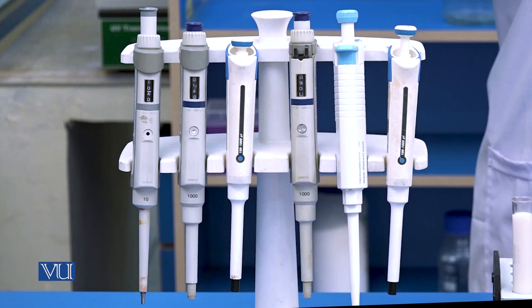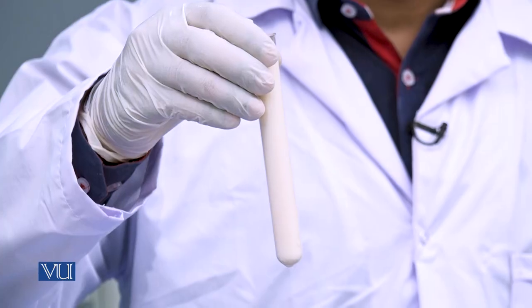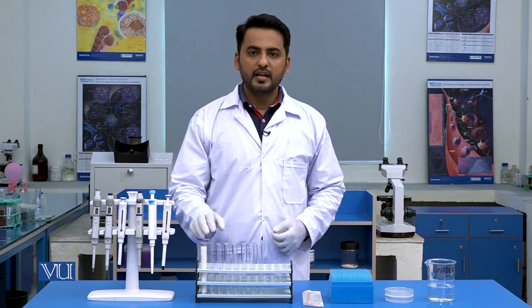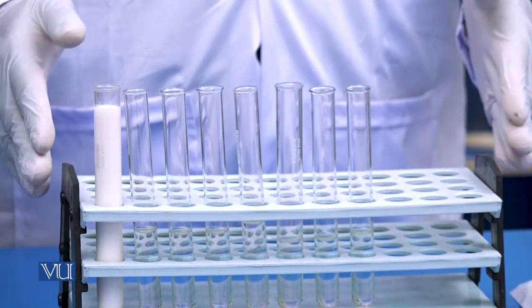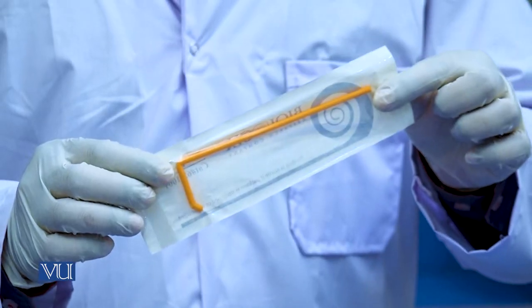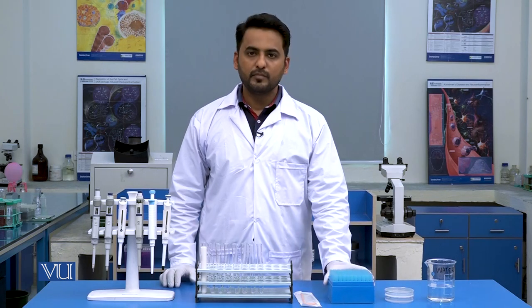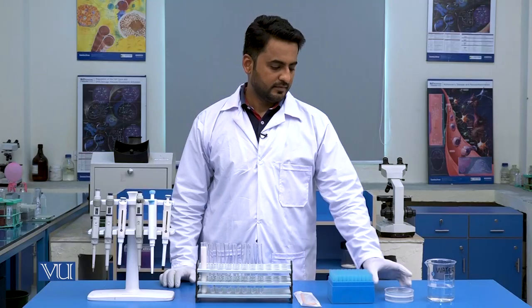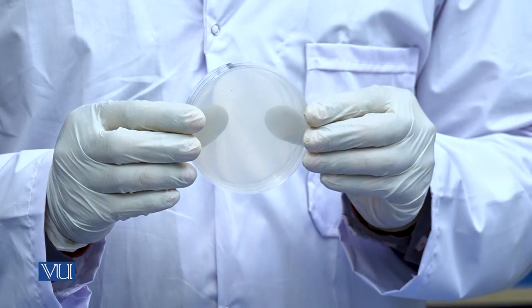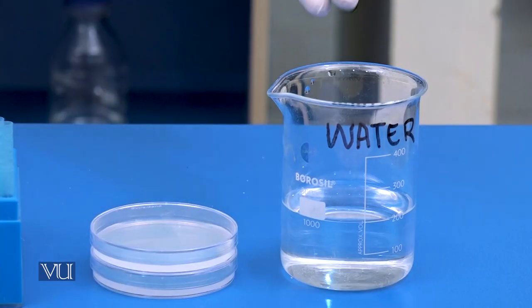We need pipettes, goat milk, glass test tubes, test tube rack, L-shaped spreader, blue tips, prepared MRS agar plates, and distilled water.